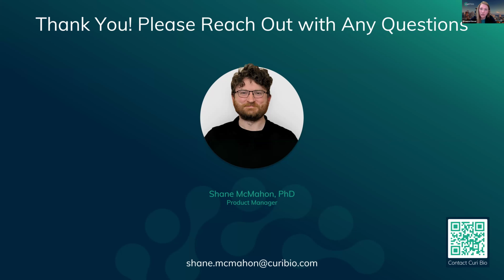First question: Does Nautilai have stimulation capabilities built in? If not, what stimulation instruments have you used? Thanks for that question. The stimulation capability is not built in, but we have a stimulator. We have our standalone Stingray, which we've used successfully with Nautilai, and we've also used our Manta Ray instrument to provide stimulation for Nautilai.